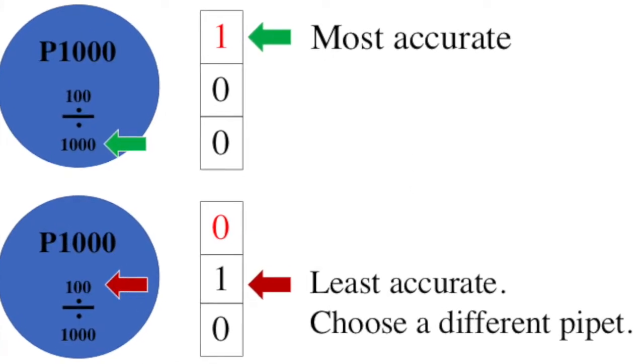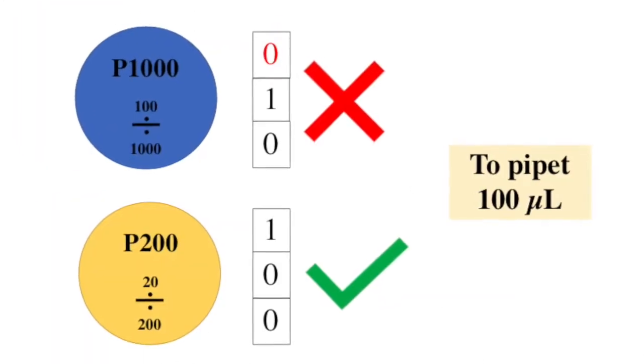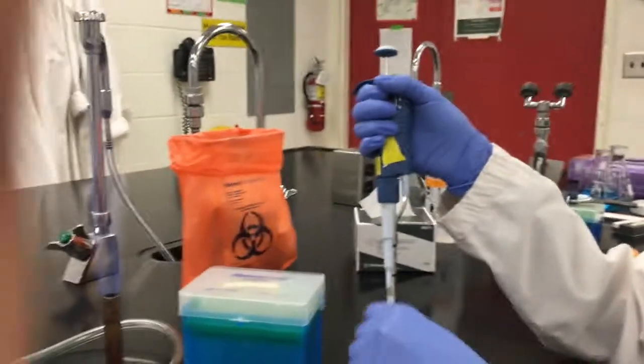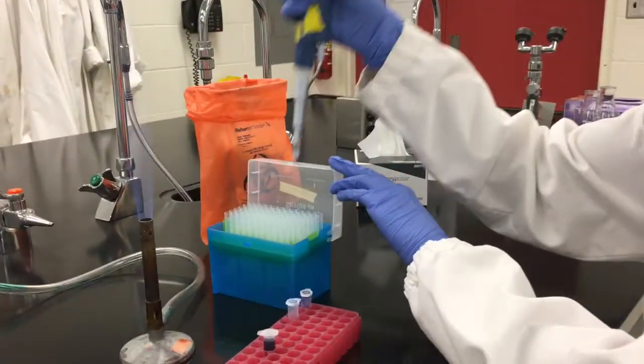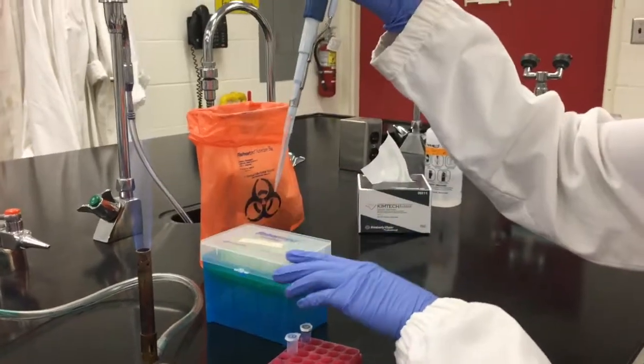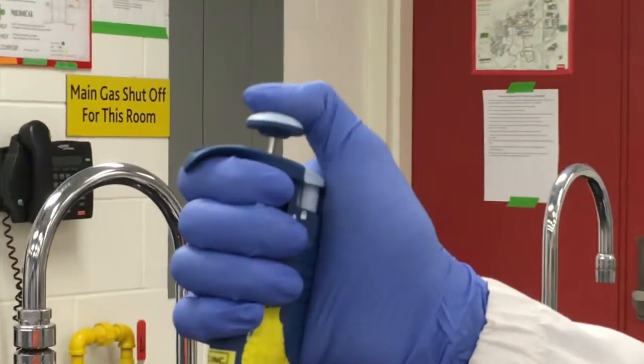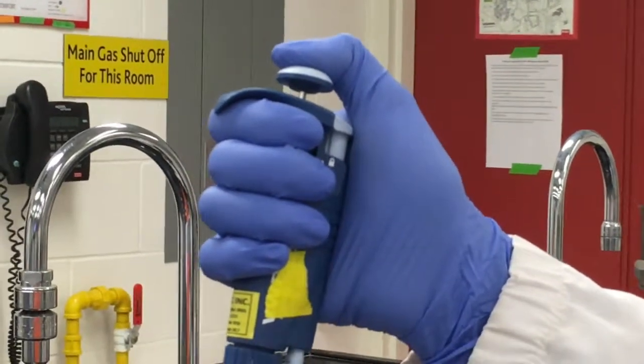For volumes nearing the bottom 10% of pipette capacity choose a smaller denomination pipette such as the P200 in this case. Grasp your pipette as shown and aseptically attach a suitable pipette tip firmly but not forcefully. Depress the plunger to the first felt stop which is the measured amount corresponding to your setting.